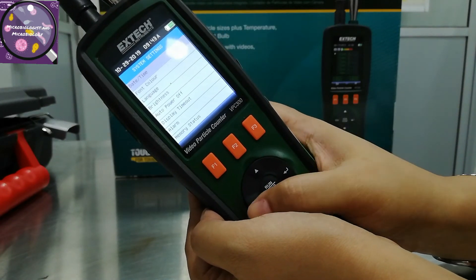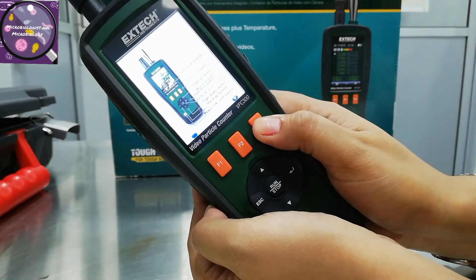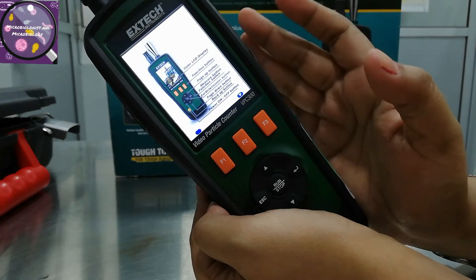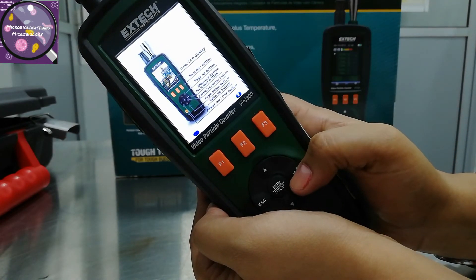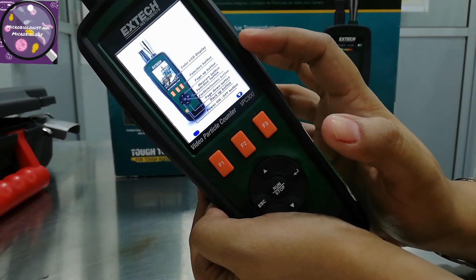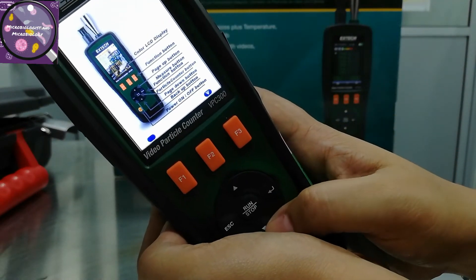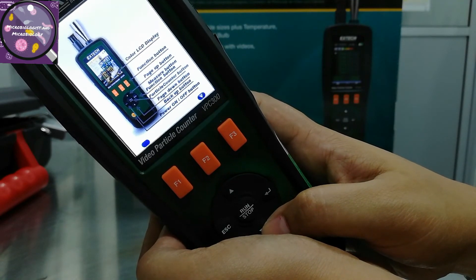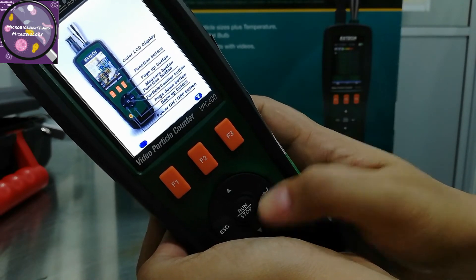Now I am escaping from here, and the third key is F3, which shows a description related to this device. F3 shows the functions and keys, like the color LCD display, the up and down buttons, the escape button, and the enter button.